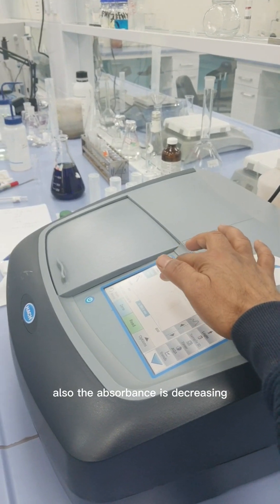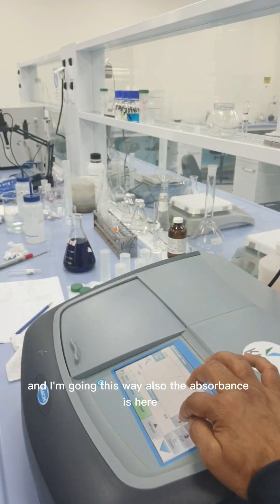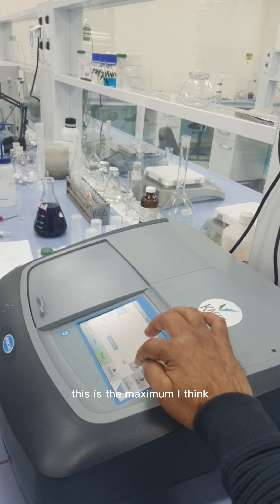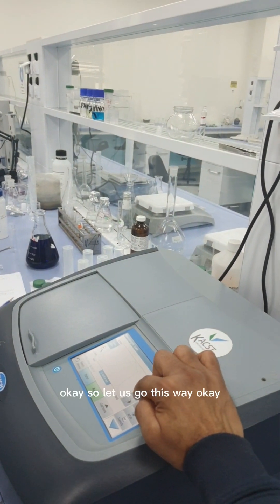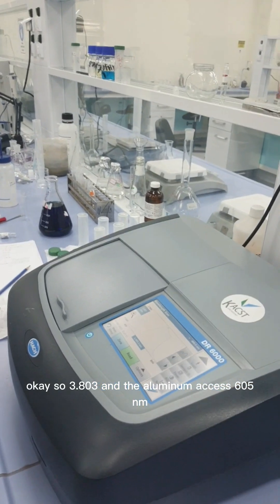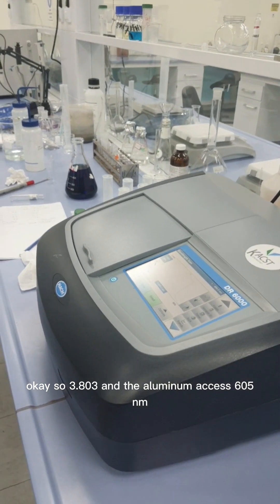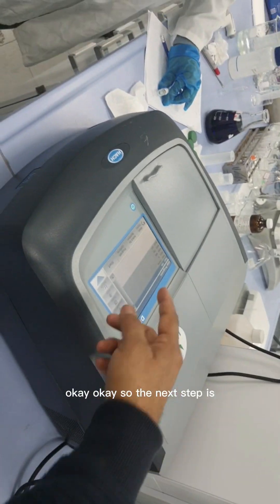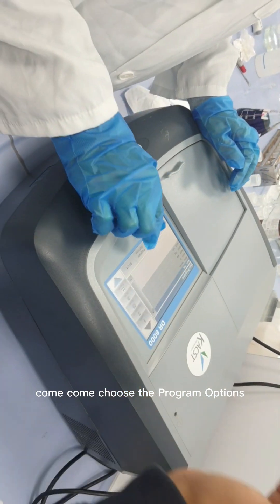Going in either direction from this point, the absorbance is decreasing, confirming this is the maximum. The absorbance reads 3.803 and the lambda max is 605 nanometers. The next step is to go to the program options.